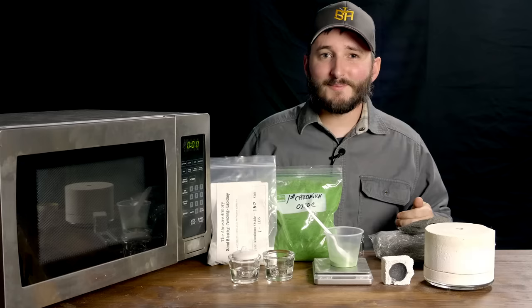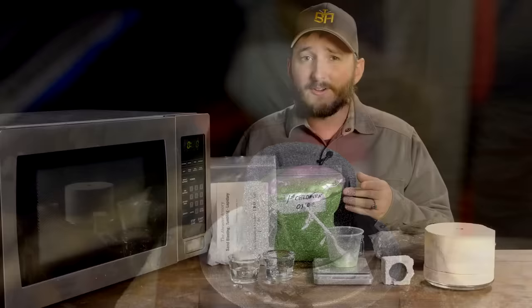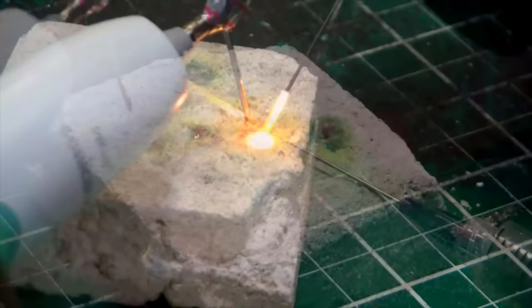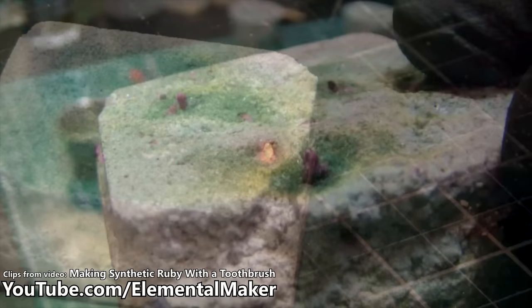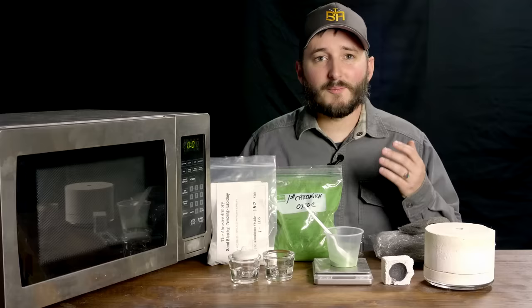This is my second video about creating synthetic rubies in the workshop. My first one involved using an arc welder and a carbon electrode and a graphite crucible to heat a ruby base material until it was completely molten into a rather impressively large polycrystalline ruby. Elemental Maker is the name of another YouTube channel that originally inspired my first video, and on his channel he had a better method: taking an oxyhydrogen torch and feeding the ruby seed material into the flame using an electric toothbrush as an agitator. This causes the seed material to melt in the flame and slowly build up on a substrate until you have rather sizable synthetic rubies — a simplified version of commercial synthetic ruby production.